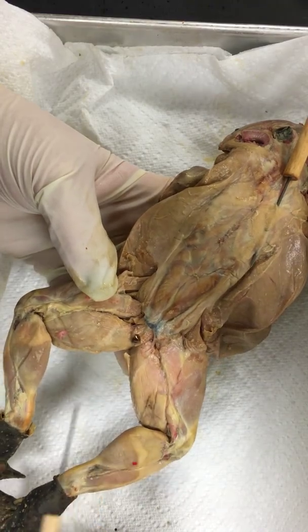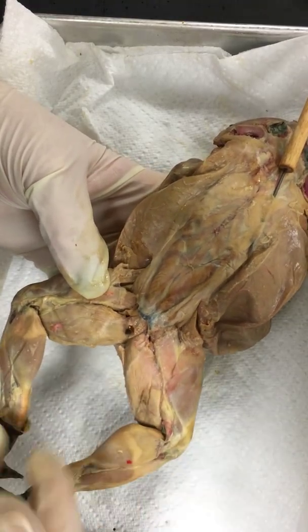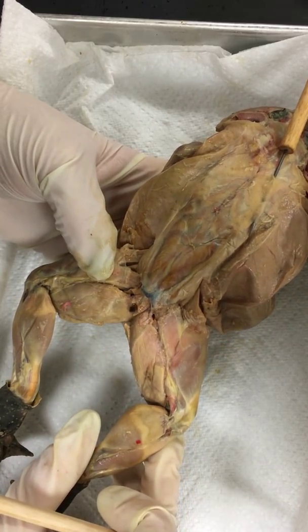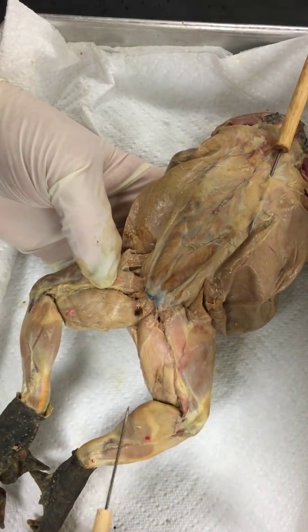My favorite is his gastrocnemius — his calf muscles. There's a great calf muscle. If you notice how strong and large his calf muscles are, think about the function. Mr. Frog does a lot of jumping and swimming, so he's going to have to have some pretty powerful muscles there.